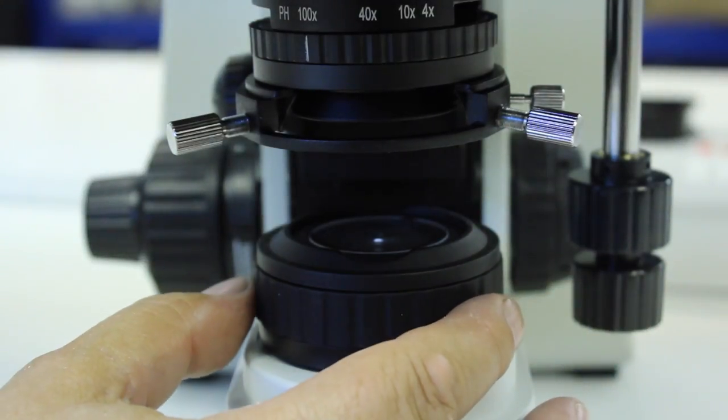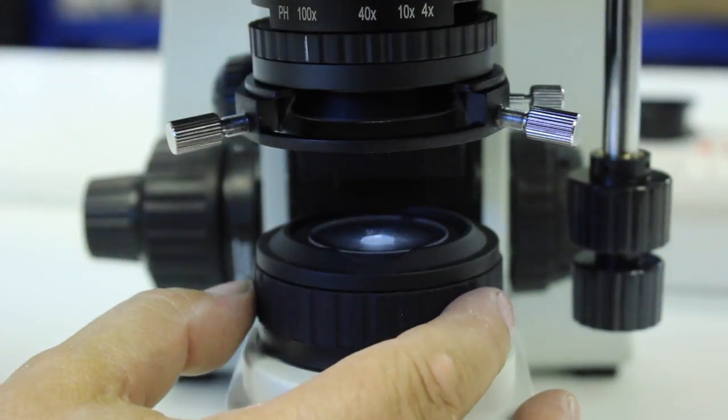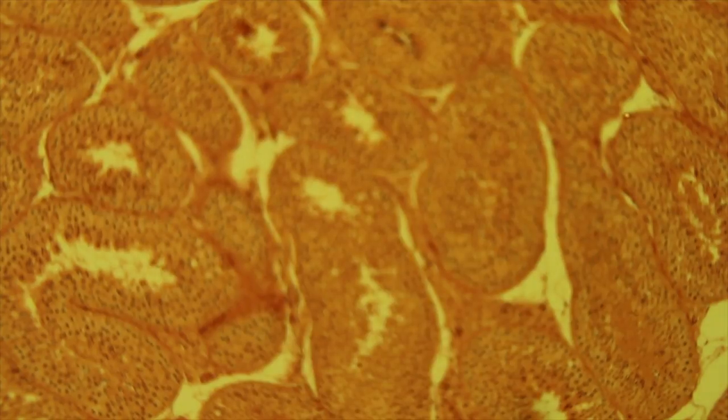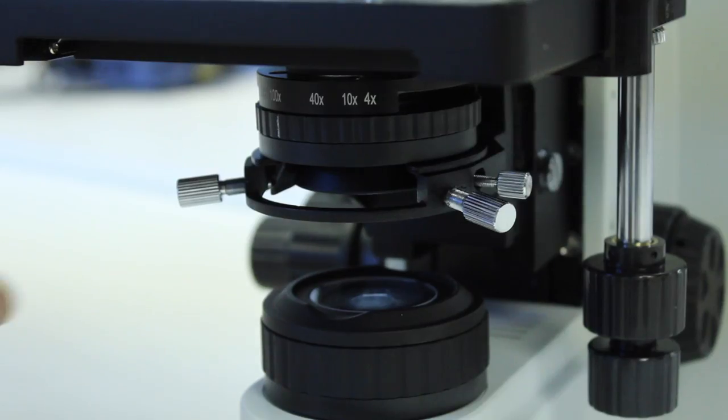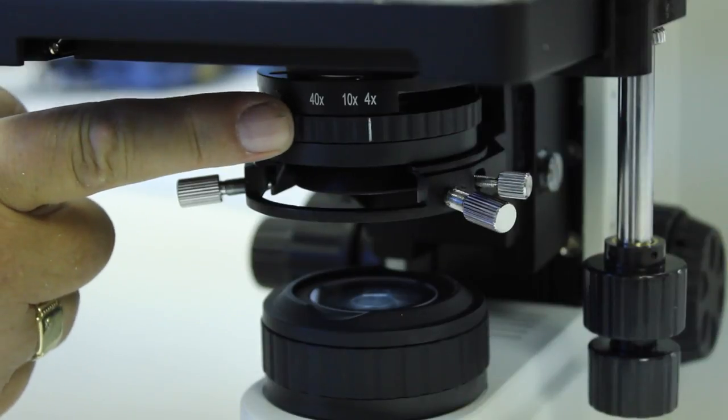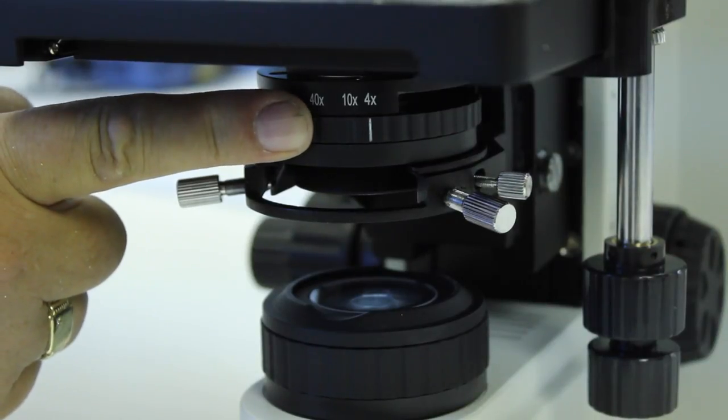You then open the field iris diaphragm until it just disappears outside of the field of view, and you'll be surprised how little you need to open the field iris to achieve that. The next step is to fully close the substage iris all the way over until it's just on the x4 mark.